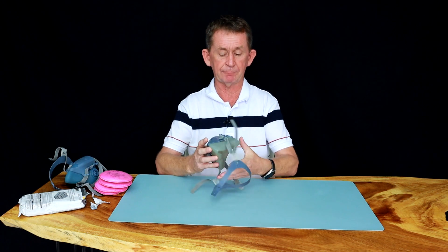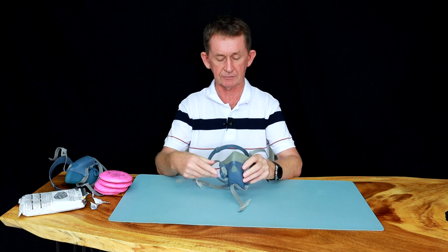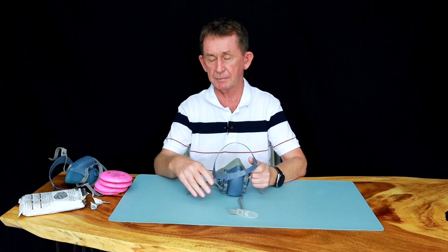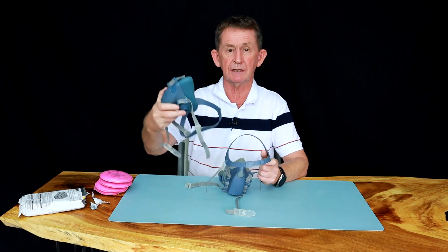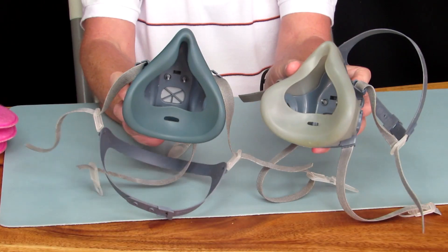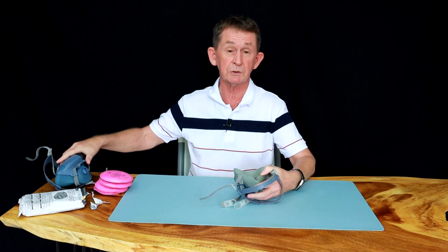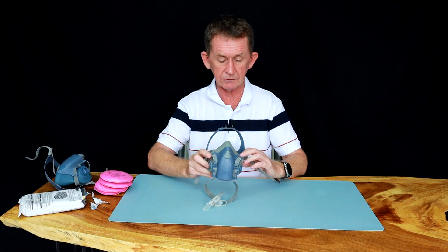Now this one does not fit me, but I use this one for our students, younger people, and the girls — this size fits them better. Mine would be medium. Here is a medium one so you can see the difference between the two. There is also a larger size which I don't actually have.